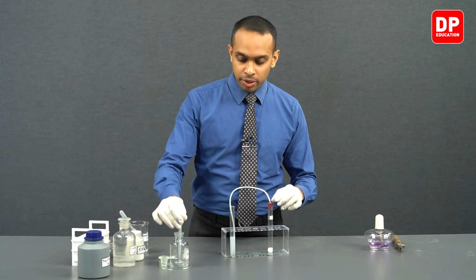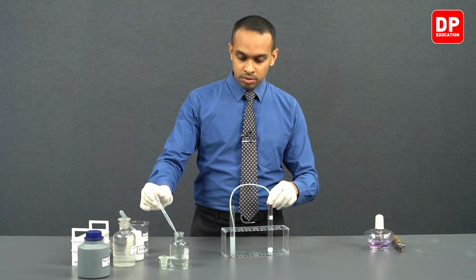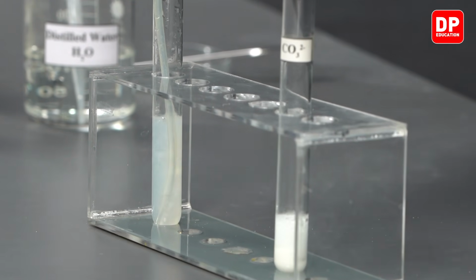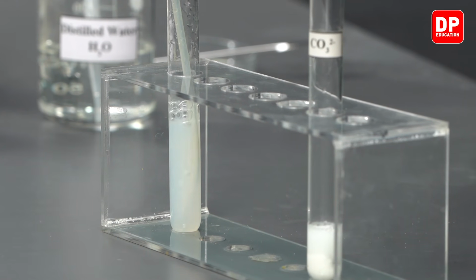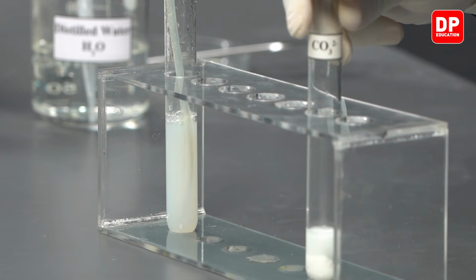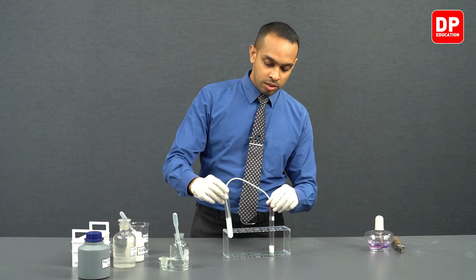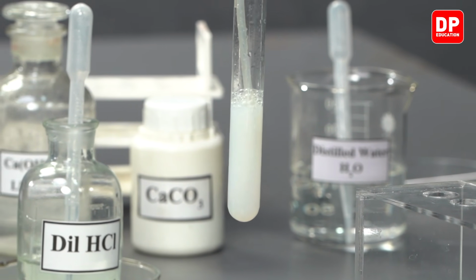Let's take a bit more hydrochloric acid and we'll add this acid to this test tube. And we'll continue to send carbon dioxide through this lime water solution. You can see now the lime water initially is increasing its color, maybe because there was more calcium hydroxide that did not form calcium carbonate.